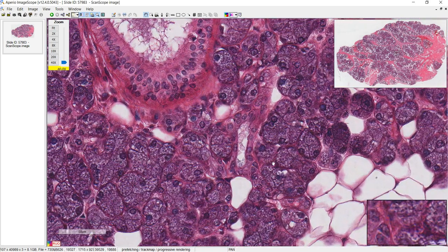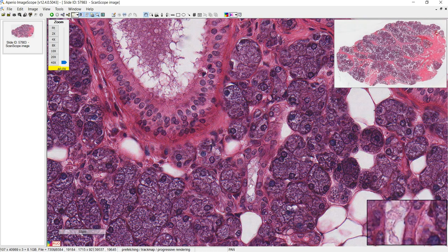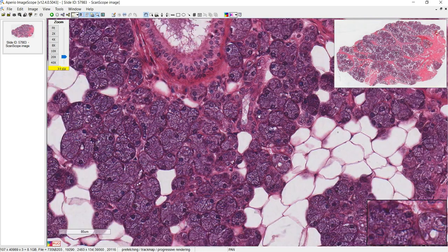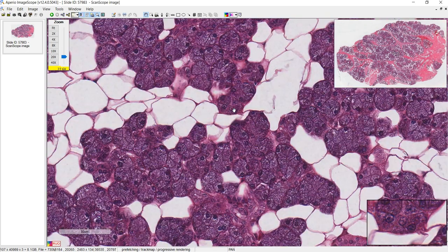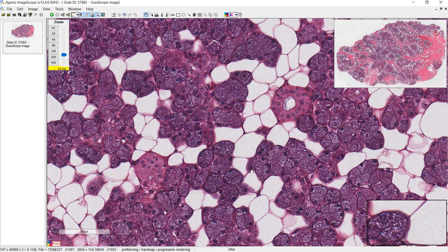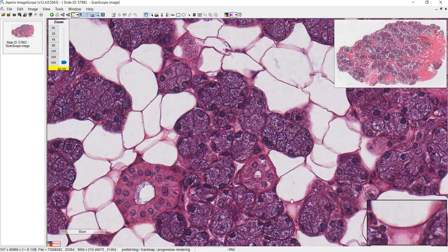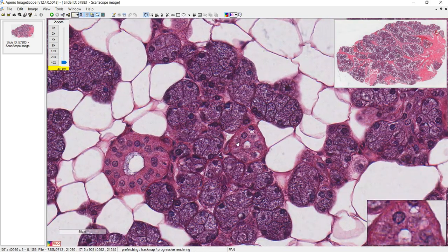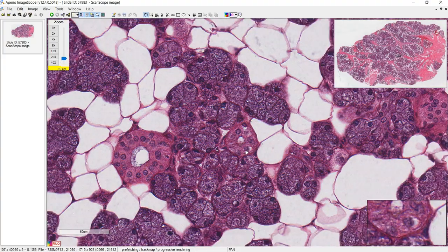All right, here's another one. Serous acini, very large striated duct. And here's your lumen of the intercalated duct. Right, so this one's probably another one, but I'd be less happy pointing that one out. All right, so you want to be careful. This is why I don't like to look for the cross-section ones. You might be tempted, oh, maybe this is an intercalated duct, but you can kind of see striations. It looks kind of like this, so I would say this is probably still a striated duct.